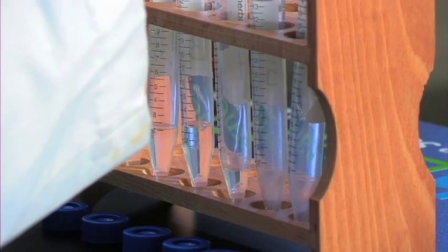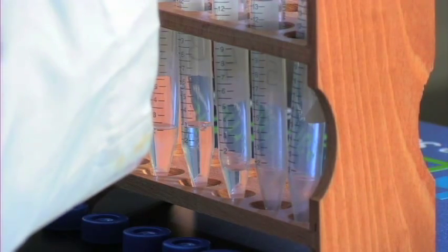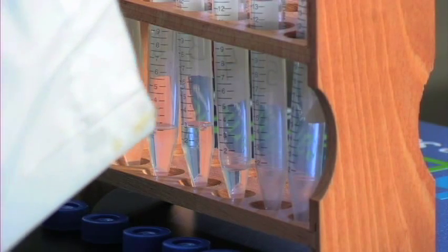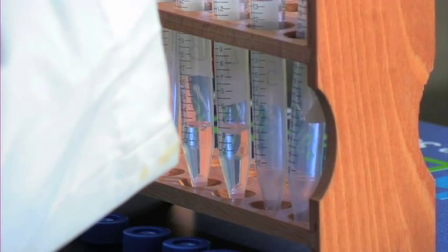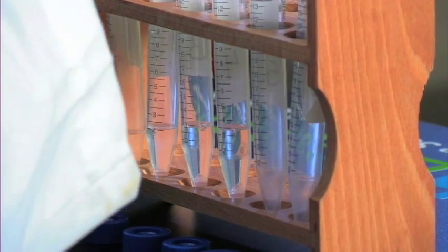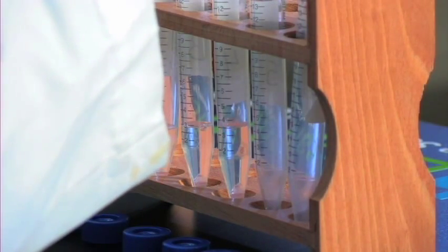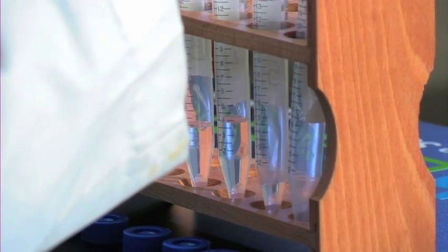Each of these graduated centrifuge tubes are filled with increasing amounts of acetone. The first tube has one milliliter of acetone and it increases by one up until six milliliters in the final tube or tube number six.